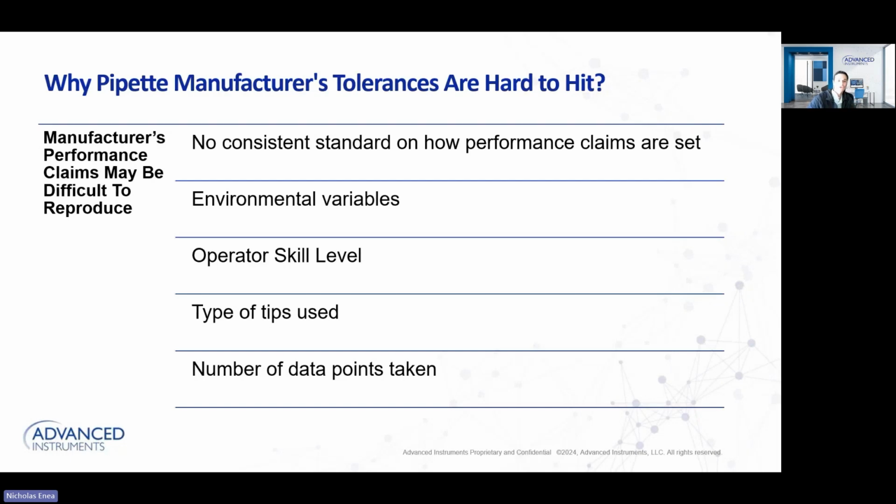But that also makes it hard for an operator like me or you to hit these specific specifications, just like your car, right? We're not all experts in pipetting. We all don't work in temperature controlled environments. We all don't have the same types of tips that we're using, right? These are things that are really out of our control that the manufacturer ultimately can control.